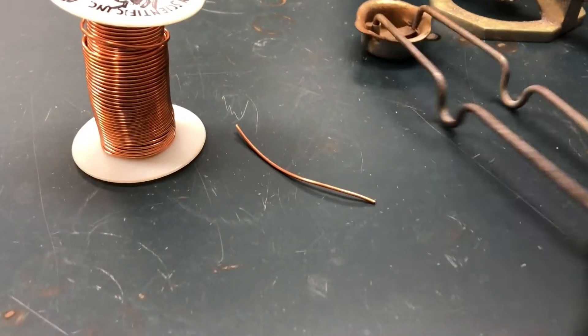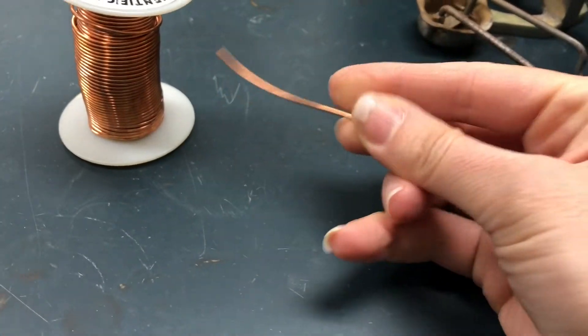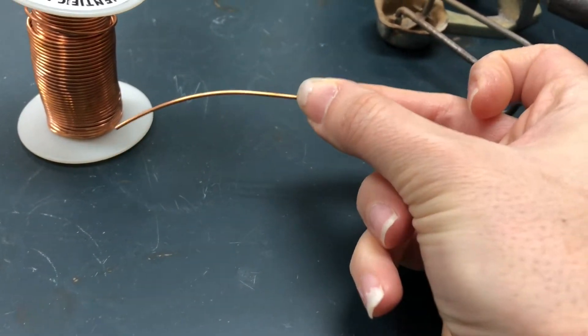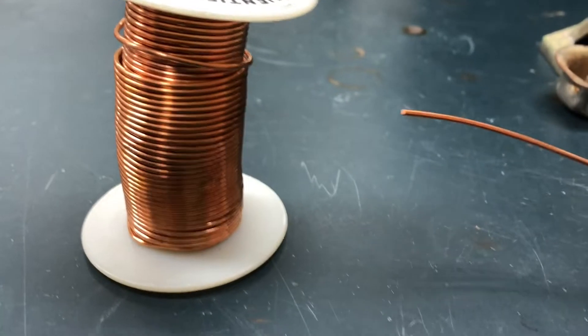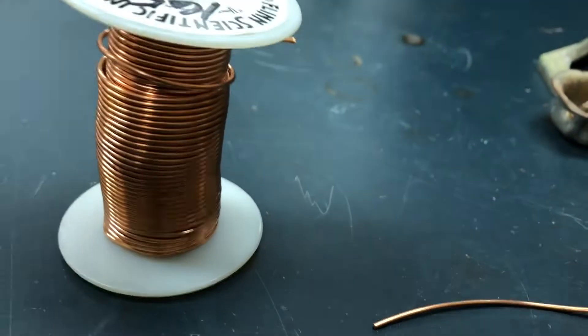We will start off with a piece of copper wire. If you notice here I've cut myself a couple inches of copper wire, so go ahead and take some observations of this pure copper wire that I got from the spool.